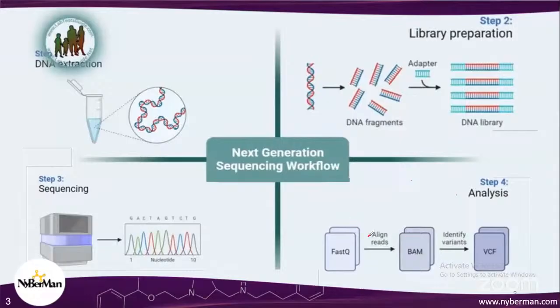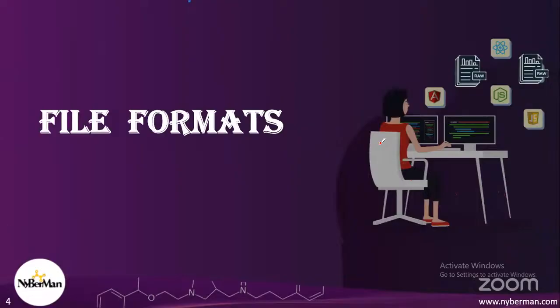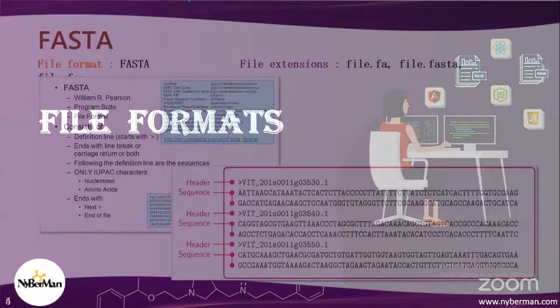Okay, so there are further analysis steps for converting FASTQ files into BAM file format and then converting BAM file into VCF file format. This is totally depending on the objective of our work and which pipeline we want to follow for further analysis of our data once we have it. Okay, so hope that is clear, exactly where the data is deriving from.